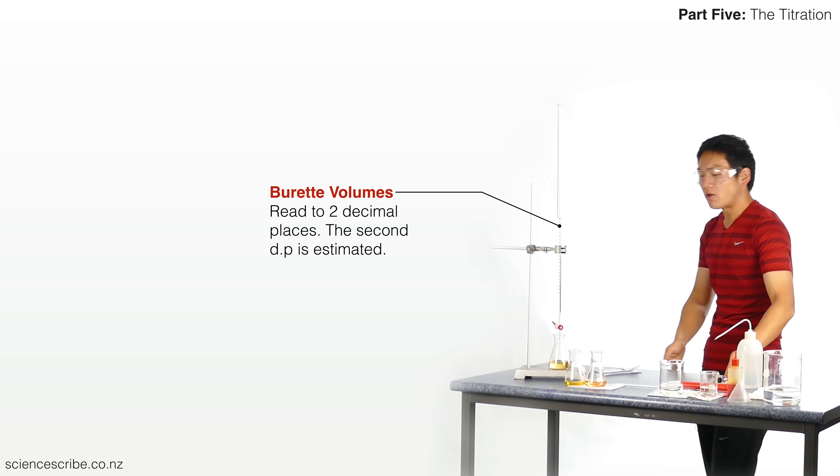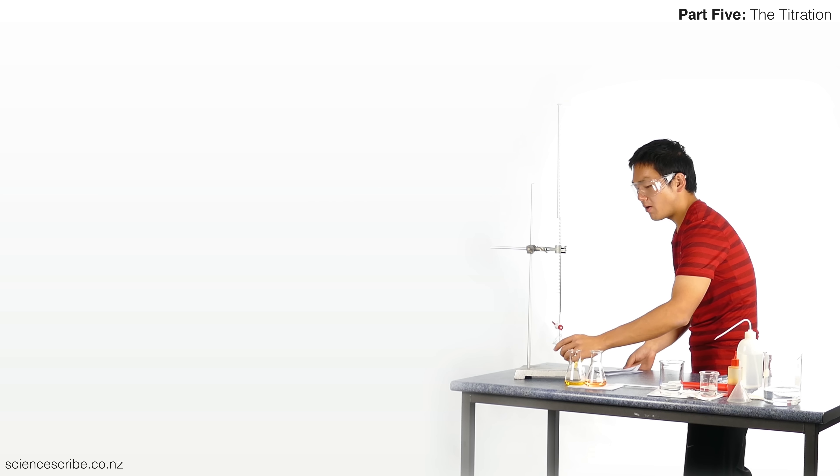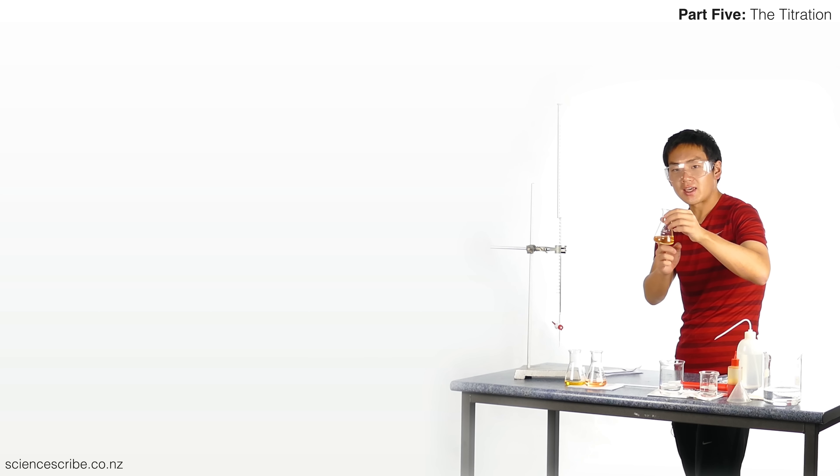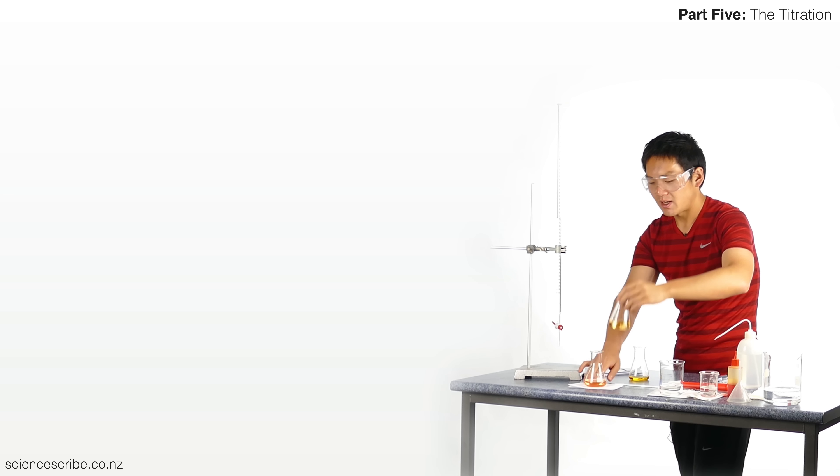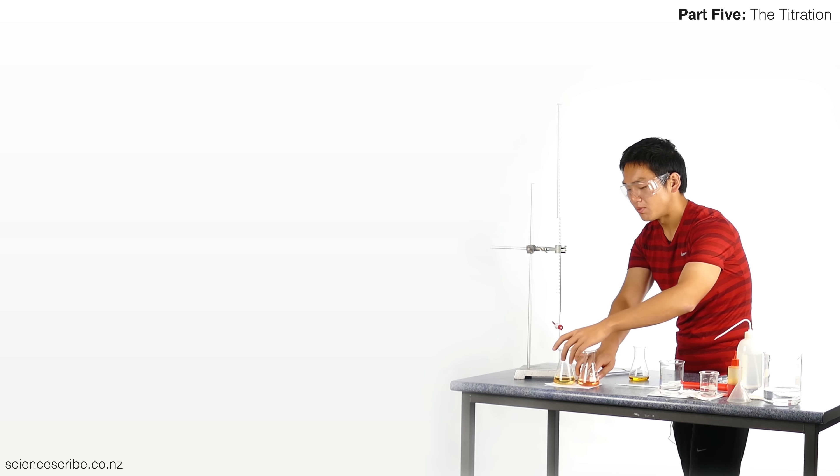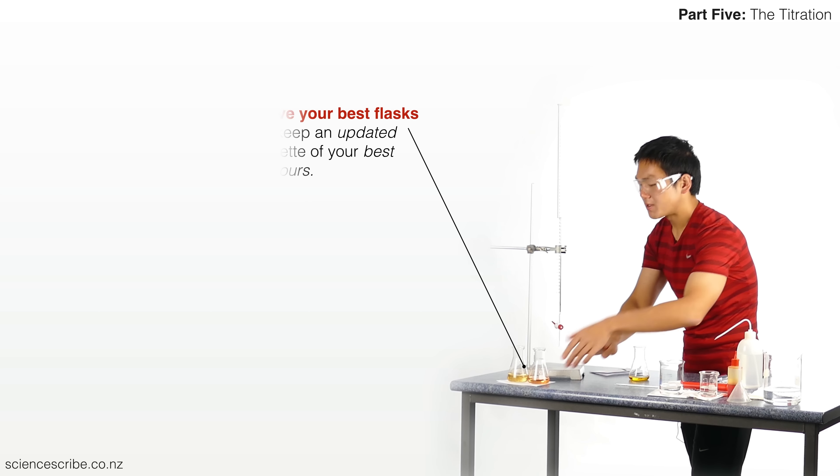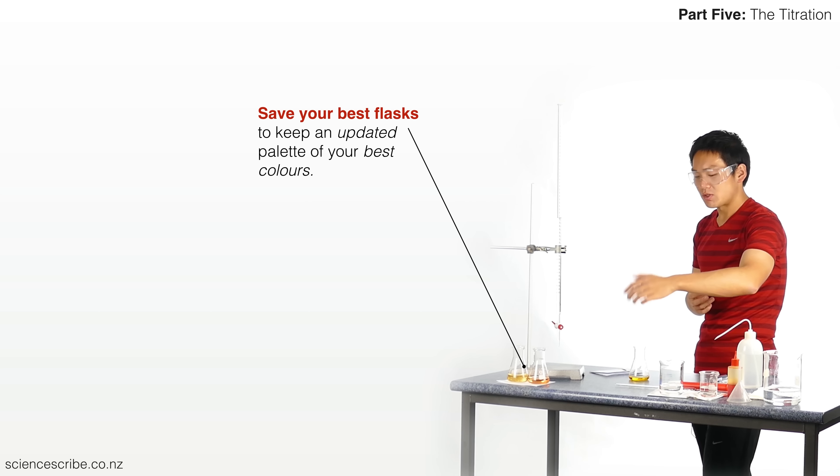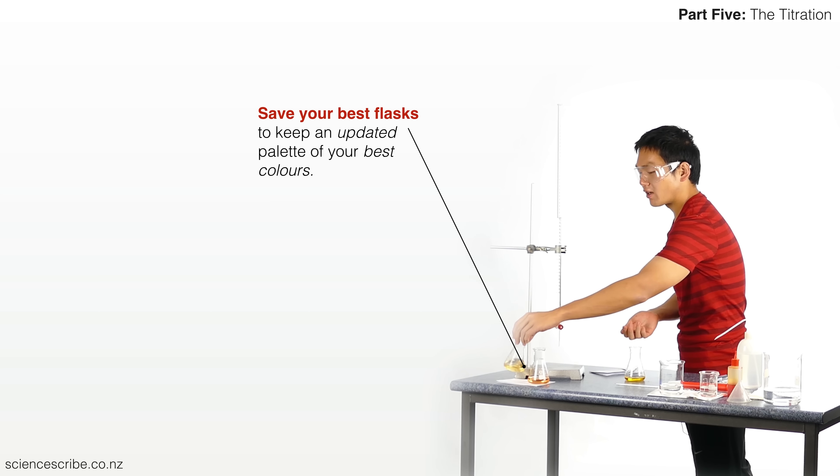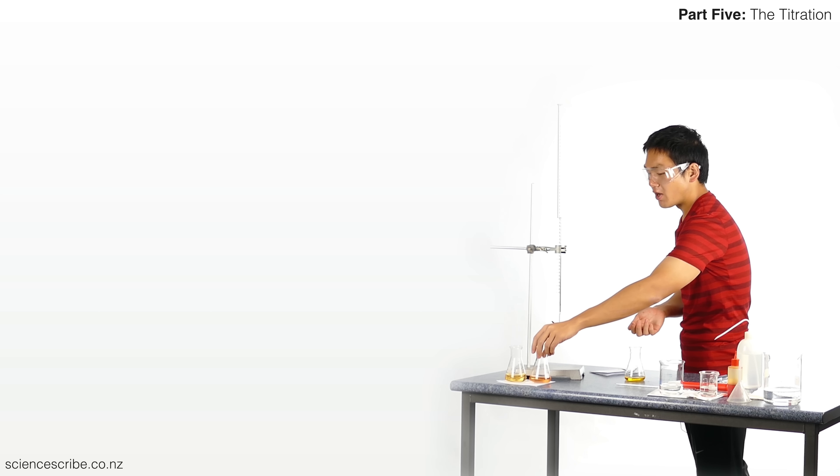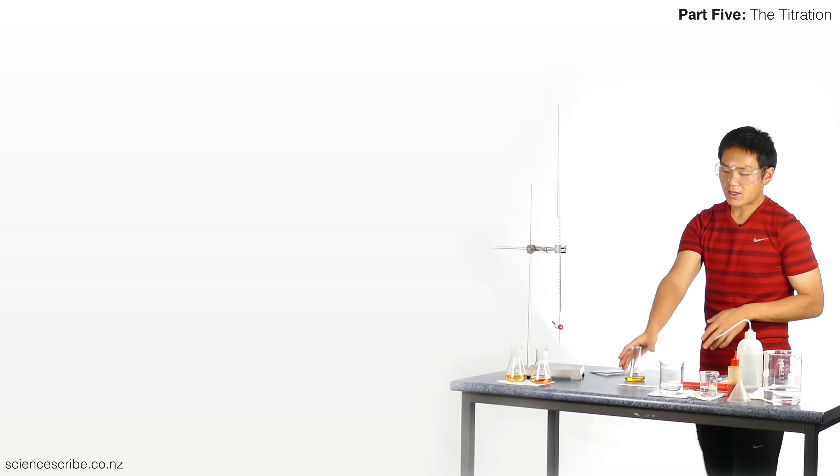Excellent. Now because this is the color I want, what I will actually do is make sure I keep this flask. I'm going to keep this flask as the color I want, and I'm also going to keep this other flask as the color I get when I've gone too much. So essentially what I'm doing is I'm saving the colors which I'm looking for. I don't actually need this yellow anymore because as I'm doing this titration, what I'm looking for is a shade closer to this one, and when I've got this much then I know I've gone too far. So now I can wash out this flask and use it again.